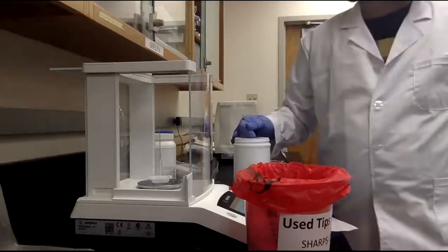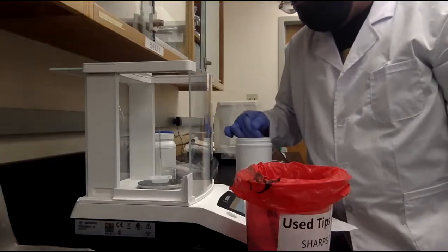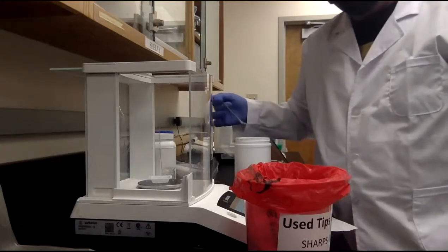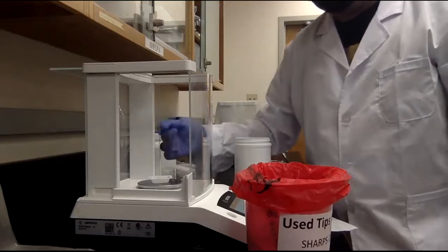So how many sig figs do we want? Just two sig figs is fine. What mass are you measuring? We're looking for 680. So I'm assuming anything that's accurate to 2 sig figs is fine. Yeah, try your best.